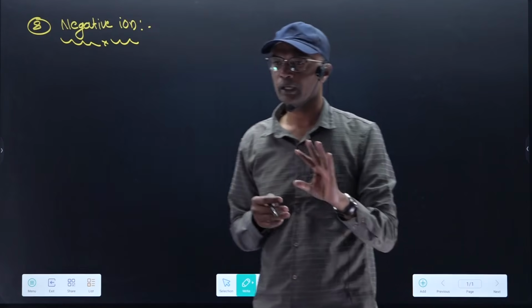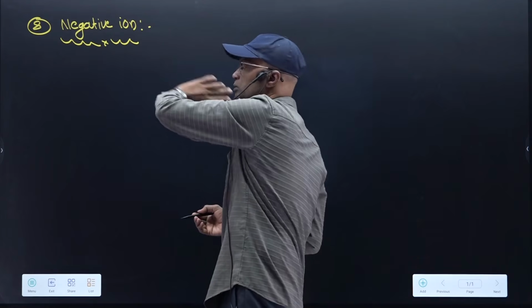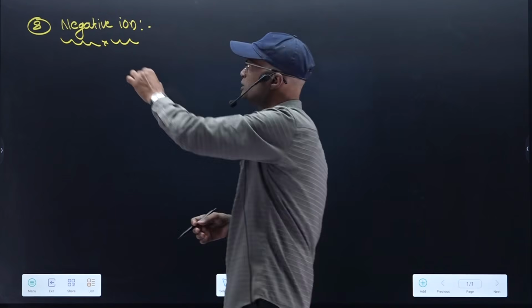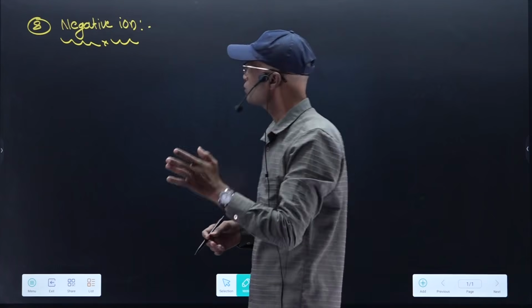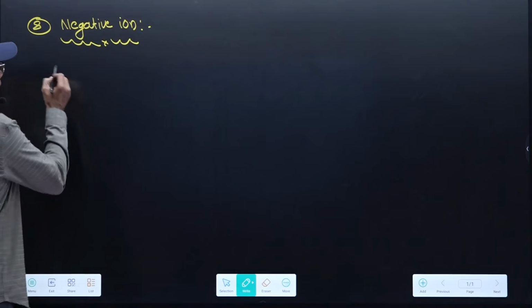It can identify only positive ions. So you will get a negative ion, but our mass spectrometry only resolves positively charged species. Negative charged species are highly impossible to determine. Negative mass spectrometry exists, but that is not included in our syllabus. I will give only one statement, then I will go directly to the metastable ion.